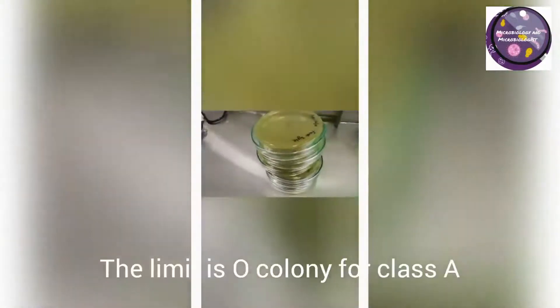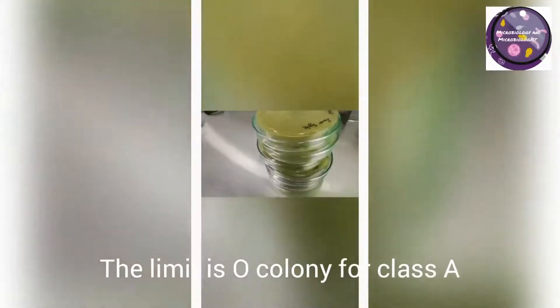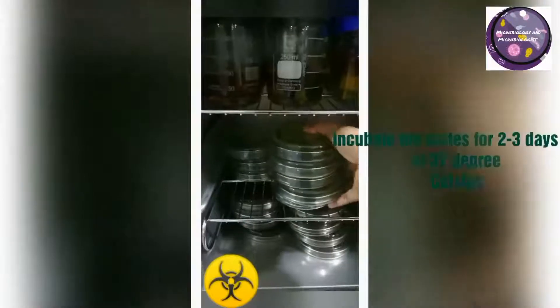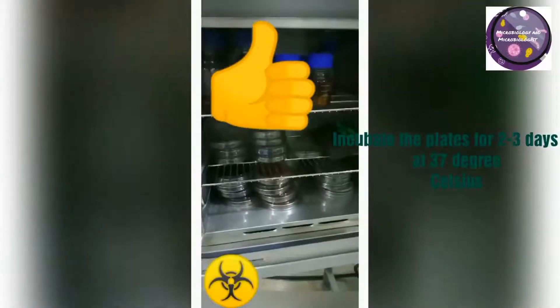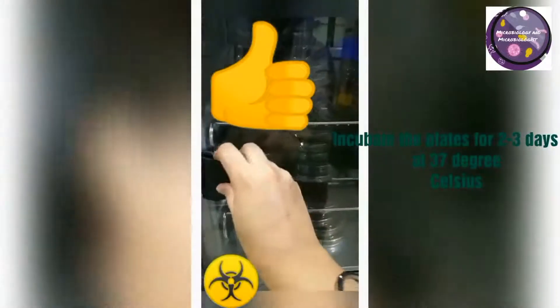Now these plates are ready to be incubated. I am incubating them for two to three days at 37 degrees centigrade. Plates should be placed in the inverted position during incubation.